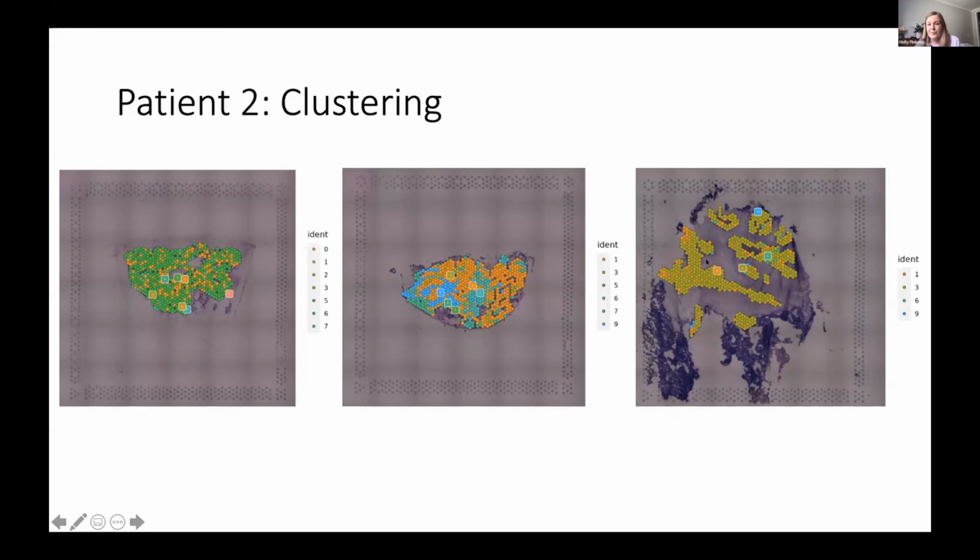And what is really cool, I think, is that the cluster from the ovary is primarily this yellowy orange colour, which you can also see in the primary tumour. It's not as much, but it is there. And this suggests to me that possibly this cluster could have seeded the ovary metastasis. So we're really seeing a tumour growth and evolution process here, and that's something that I'd really like to investigate more in my project.